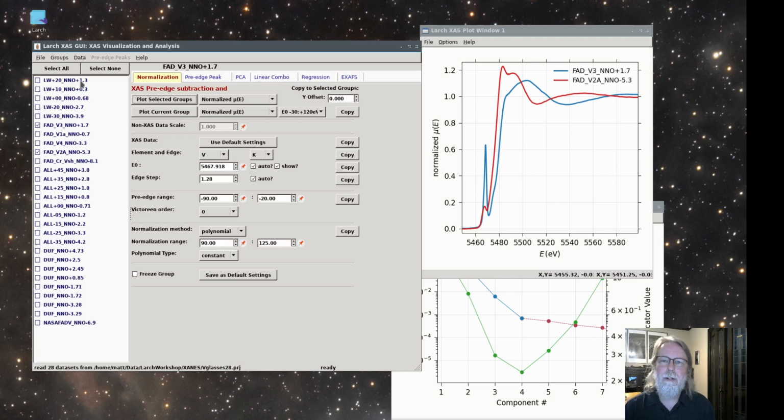And so a measure of oxygen partial pressure, fugacity, is an important measurement for Earth scientists. And so for all of these spectra, we actually know a starting value for what those numbers should be.